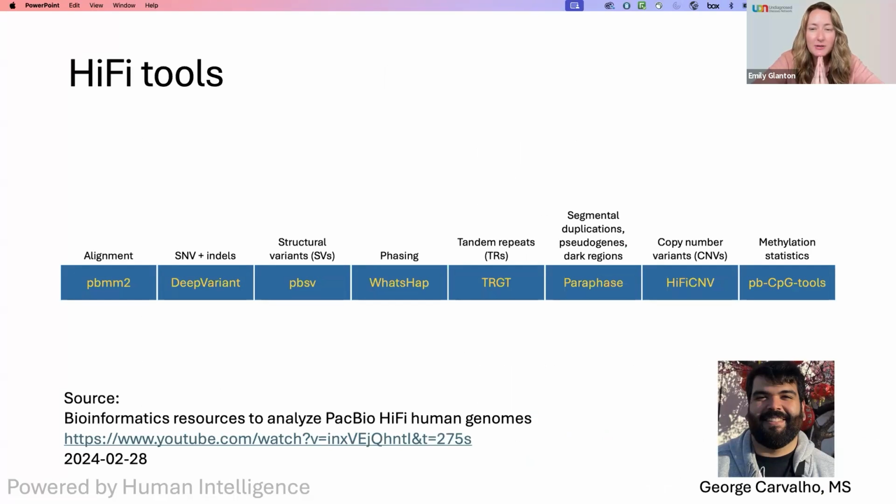Thank you. And then another question that someone might have missed: did you also use the CoLoRSdb PacBio data to filter for allele frequency? I did not. What is it called? CoLoRSdb PacBio? Yes, and it looks like the O's are lowercase, so it might be an acronym. Okay, I didn't know of it. I'm going to look it up.